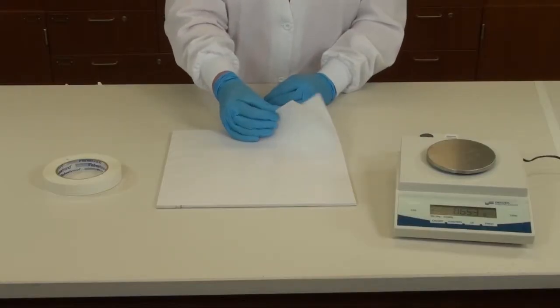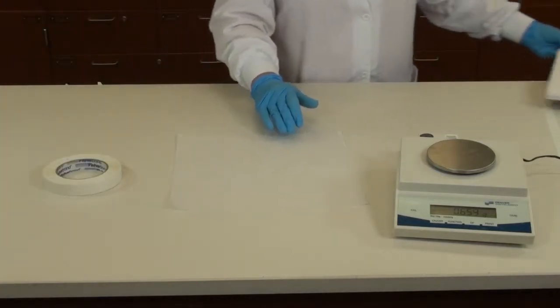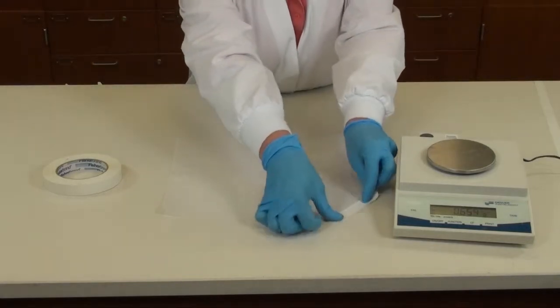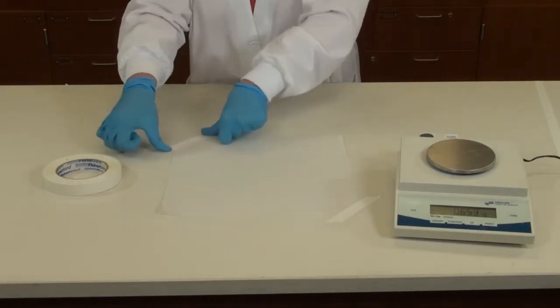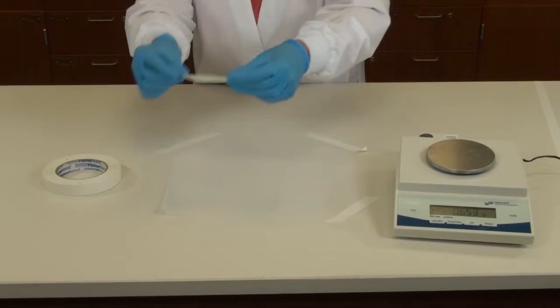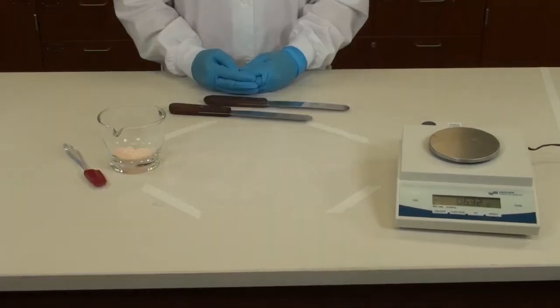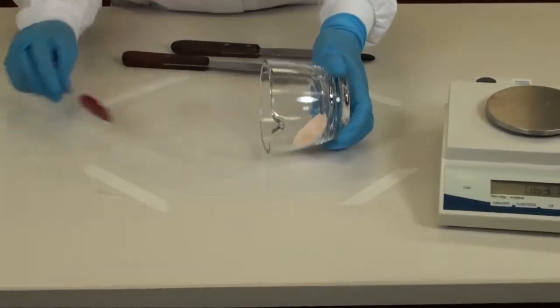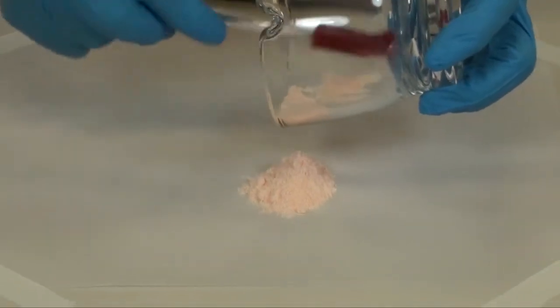Now get a piece of ointment paper and tape it firmly down onto the work surface. You are now ready to place the powder onto your ointment paper. Use a rubber spatula to retrieve all the powder from the mortar.